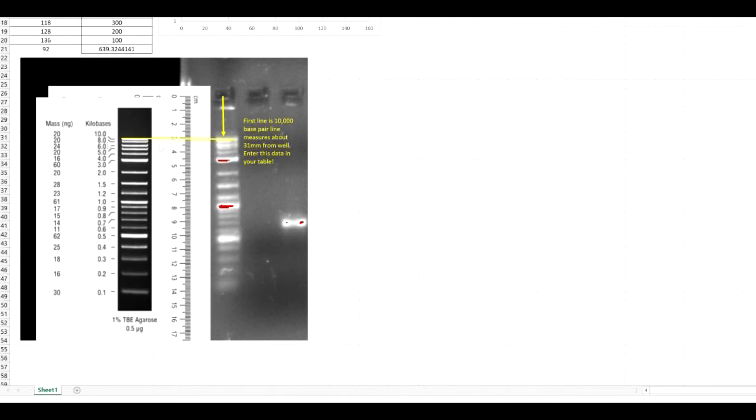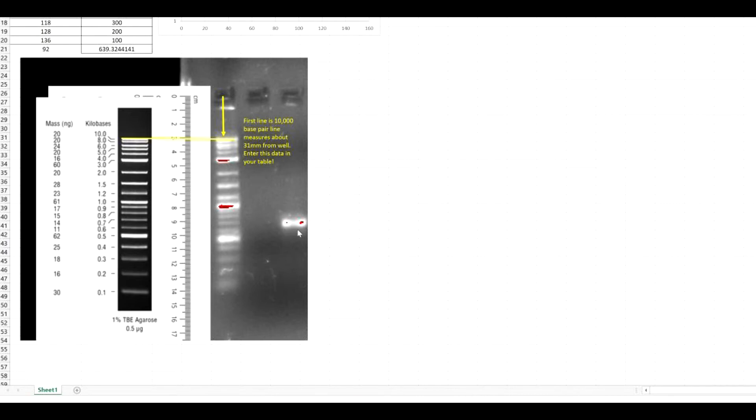So one thing to note first is that these bands here on this ladder will always correspond to the bands of your ladder in your gel. Basically, what you want to do is take this ladder with this known amount of base pairs, and you want to figure out how large this size is, which is your PCR product, or it could be extraction or any other sample.